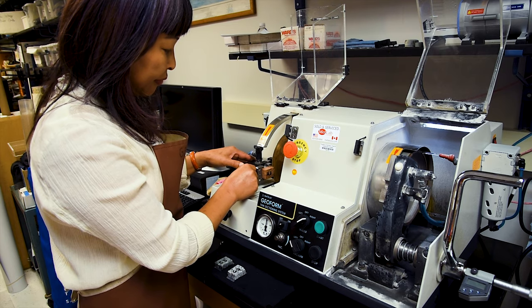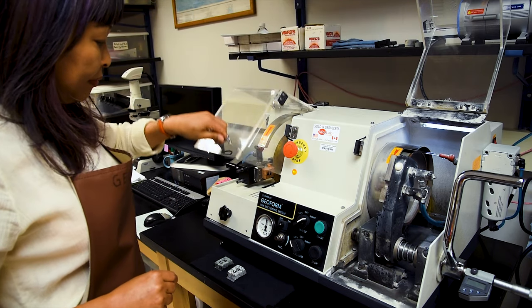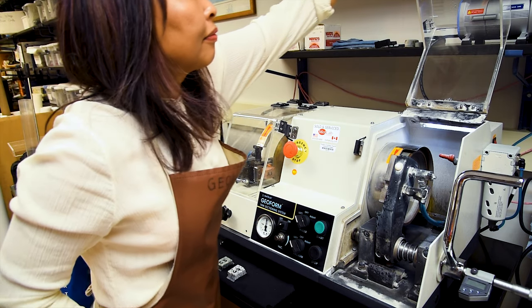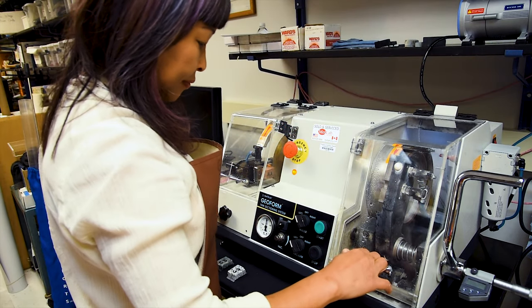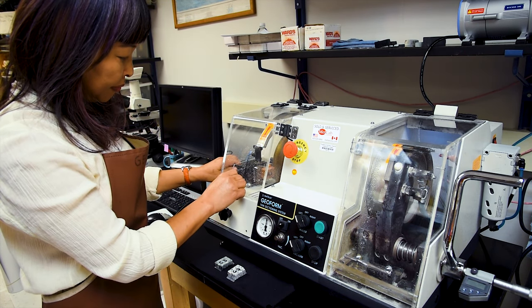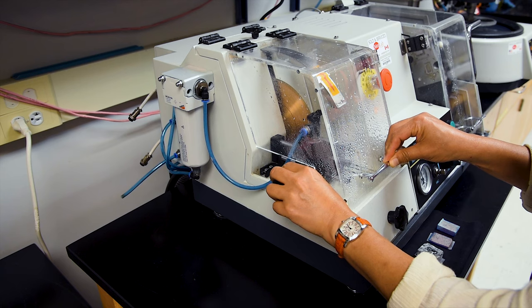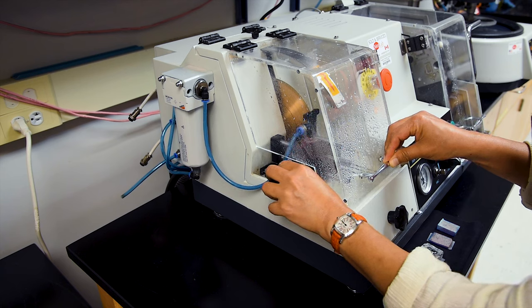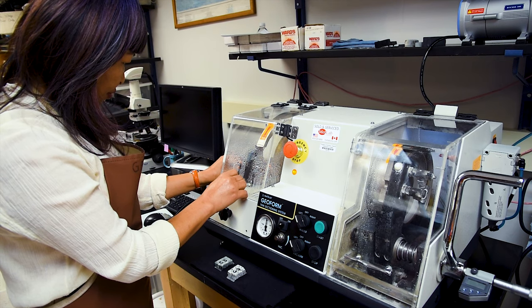With the slide and chip firmly attached to the vacuum chuck, Sarah will close up the splash guards and switch the water flow on the GeoForm from the grinding side to the saw blade side before powering on the saw. Once the saw has been activated, Sarah will begin pushing the sample into the saw blade. As with the rock saw, you should push forward with enough force to cut through the rock chip, but not so much as to cause unnecessary strain on the saw blade.